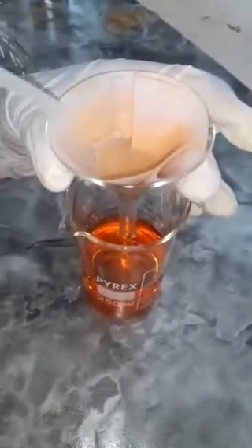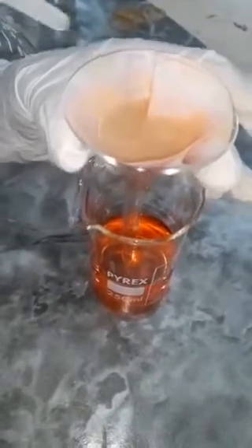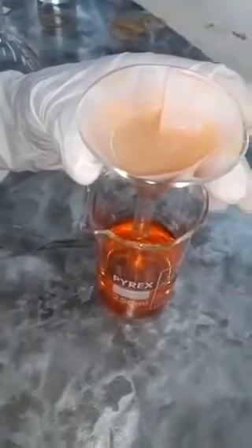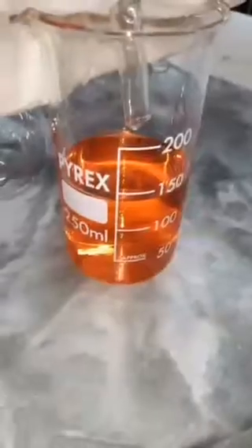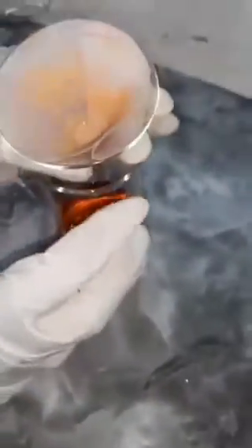So now I'm going to wash the filter paper with distilled water. So add a bit of distilled water on the filter paper and we'll add the washings to the filtrate. So now we've filtered everything. Everything has been filtered, including the water that I just poured. Now we're going to transfer the filtrate into a 250 mL volumetric flask.